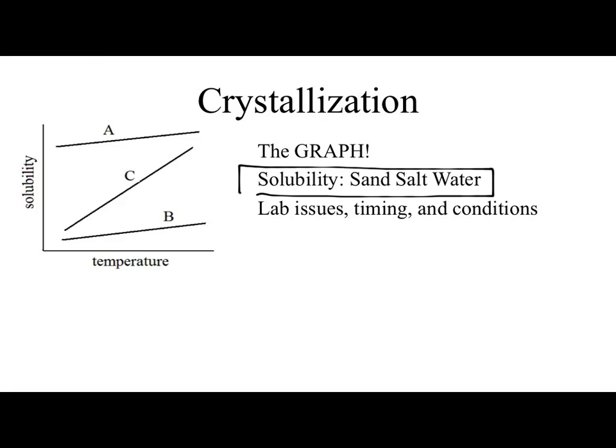To dissolve it, we're looking at our solubility differences. So we'd want to dissolve our crystals in the solvent. However, if we try to dissolve our crystals at low temperature, what's going to be the problem? We're going to have to add a lot of solvent. If we add a lot of solvent, our compound sure will dissolve, but we need variable solubility. We need our crystals to come back out of solution.